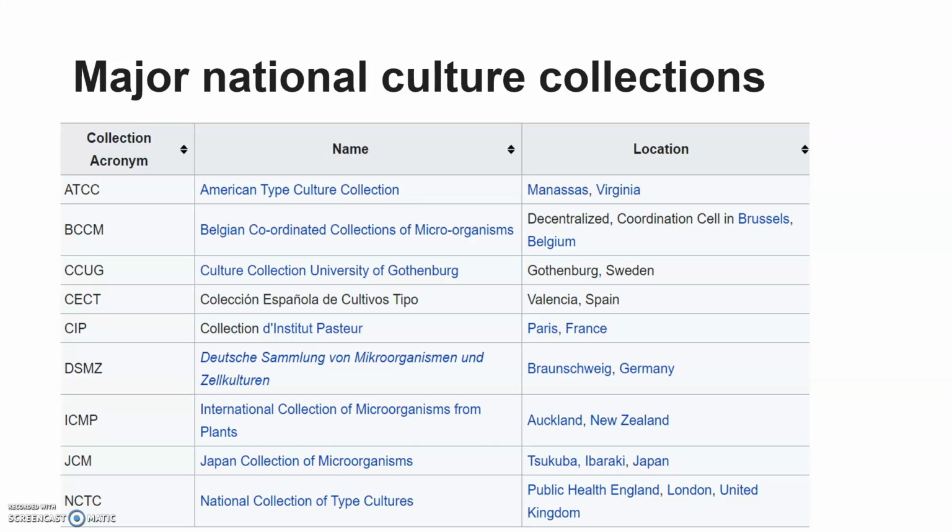because it shows all the tests of the typical E. coli. For example, while we are taking E. coli and using ATCC E. coli strains, we can keep that strain as a control to check various biochemical reactions carried out by E. coli. And when we are performing a test, we usually keep a control in the laboratory or in the hospital. For those control strains, we are using ATCC or NCTC.